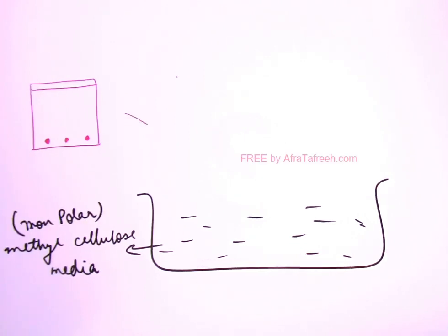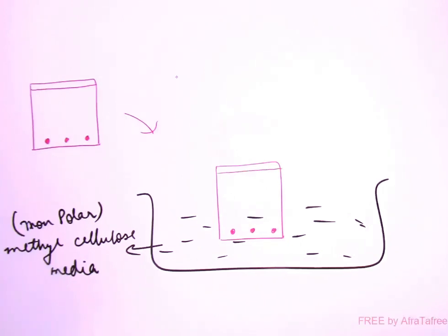We will dip the paper in the solvent, with the side of amino acid attached downwards. On the other hand, a line is there, right? Now when we dip the paper in the solvent, this solvent will move upwards with capillary action. The solvent is moving upwards. The paper is getting wet. When we are doing the experiment, we can see the paper is getting wet. The wetness is coming up.